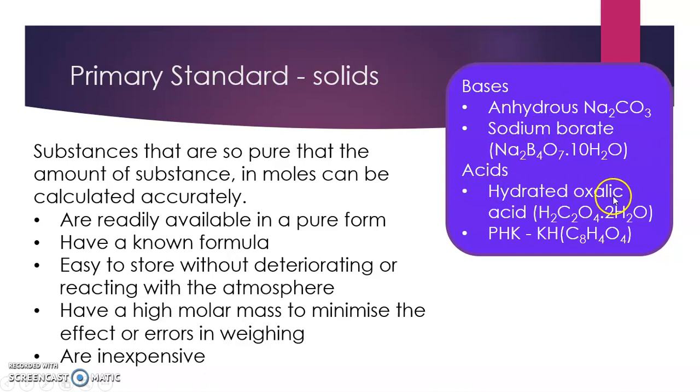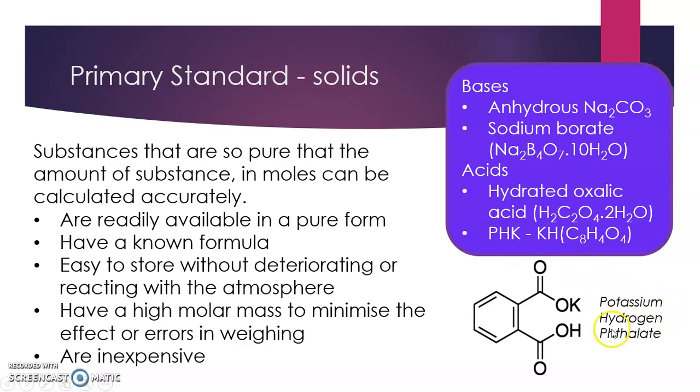Acids, we use hydrated oxalic acid, or what we call PHK, which is essentially potassium hydrogen phthalate. Okay? So this hydrogen can be donated. So both acids are actually organic acids, and they are weak acids as well.